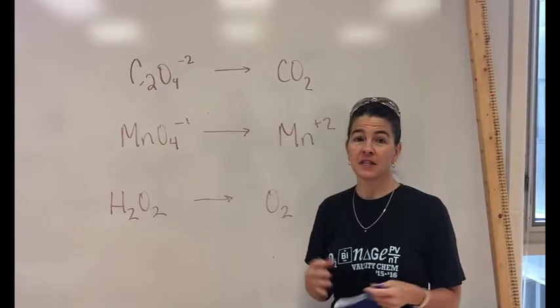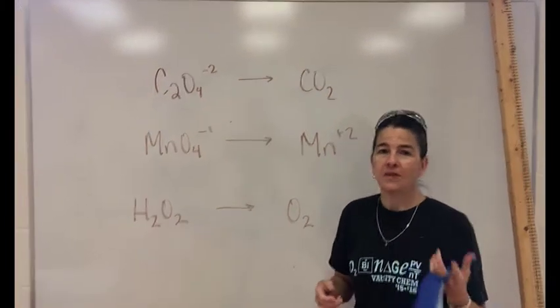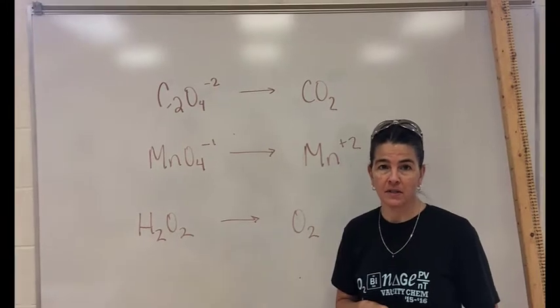Hi guys, so today's lab is a big one. We're going to combine the ideas of redox, which you've just been looking at, with the idea of titration, and that's going to be the big conceptual part, putting those two things together.